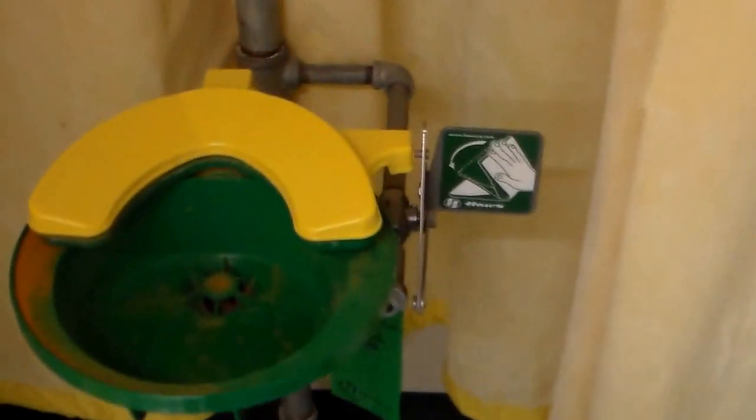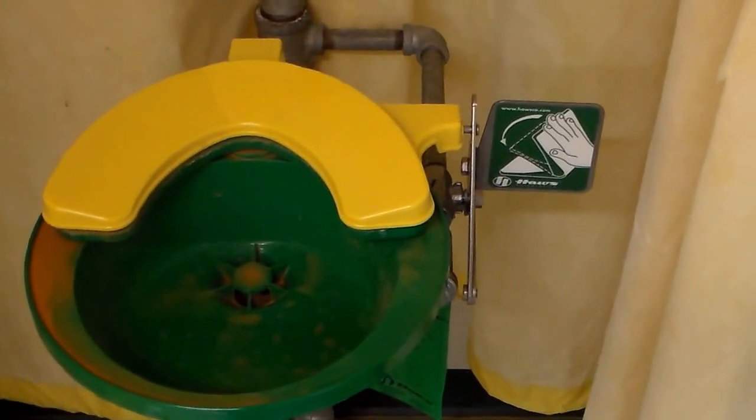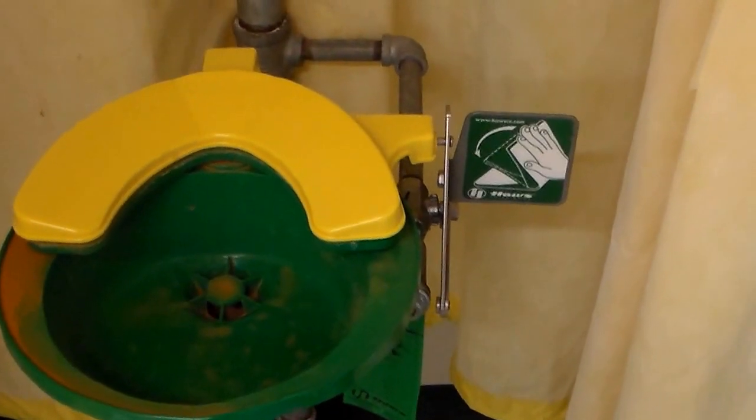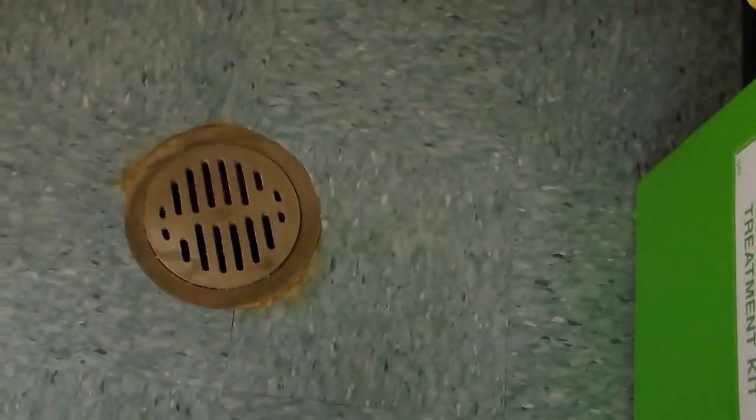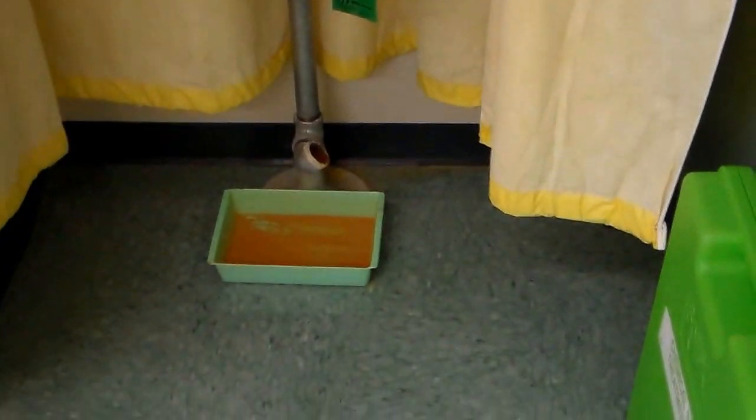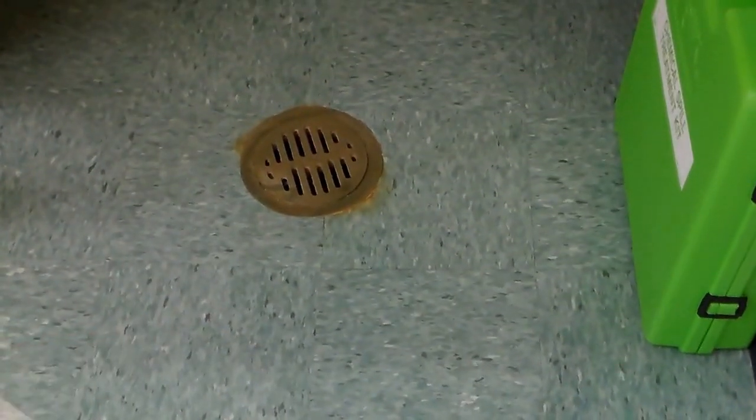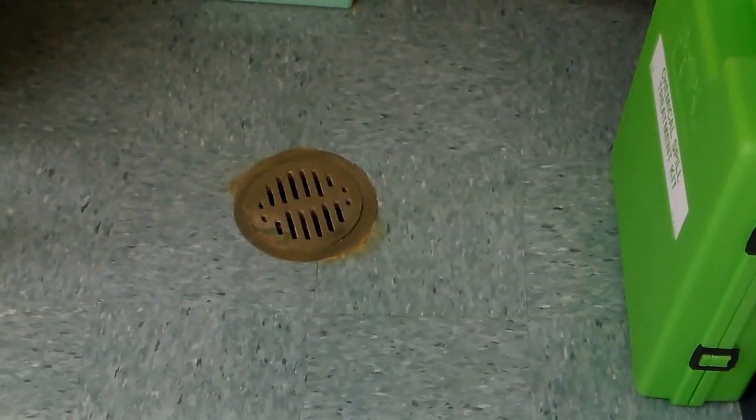You'll also notice that the water tends to be a bit rusty. That will not hurt your eyes more than the sulfuric acid you're trying to rinse out. So just stick your eyes in the eye wash anyway, but we don't play with it just because it'll get the floor pretty wet. If somebody goes to the eye wash station or safety shower, we want someone to go with them because this floor turns very slippery and they'll need somebody to help secure them as they're standing.